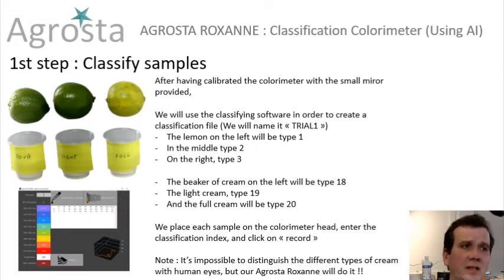We will test cream as well. We have soya cream defined as type 18, a light cream as type 19, and full cream as type 20. We will place each sample on the colorimeter head, enter the classification index and click on record. For your information, it's impossible for the human eye to find which cream is soya, which cream is light, and which cream is full — but our Agrostar Oxan will find it.